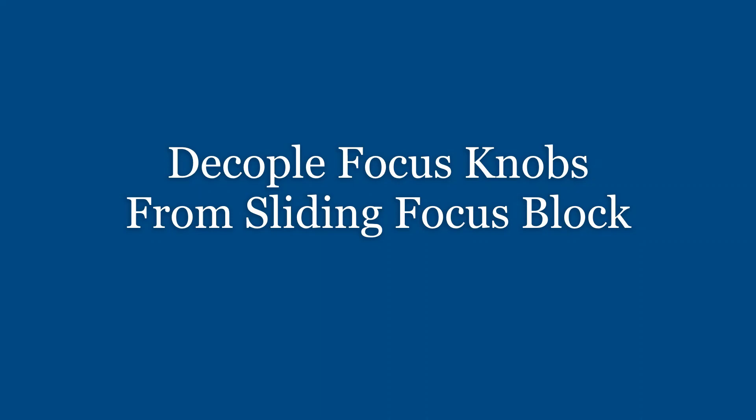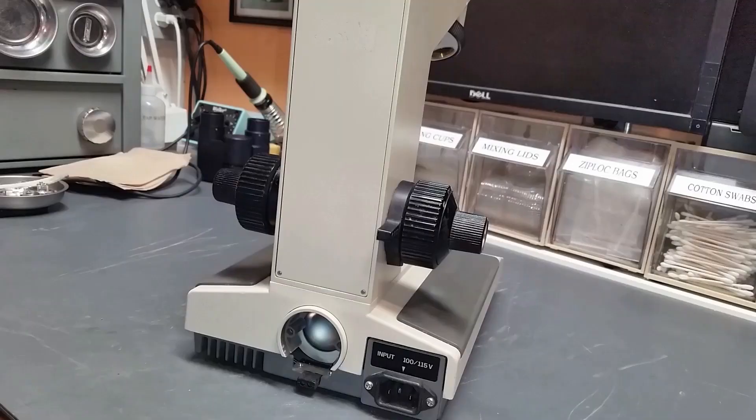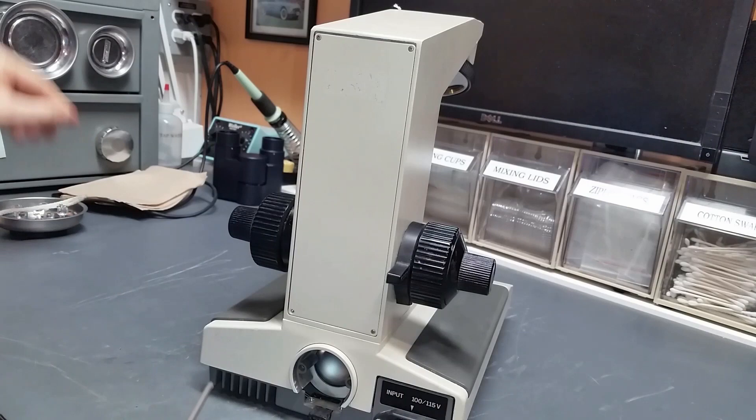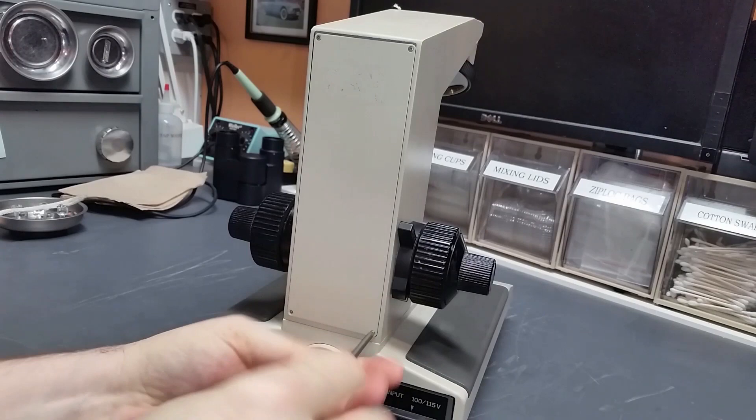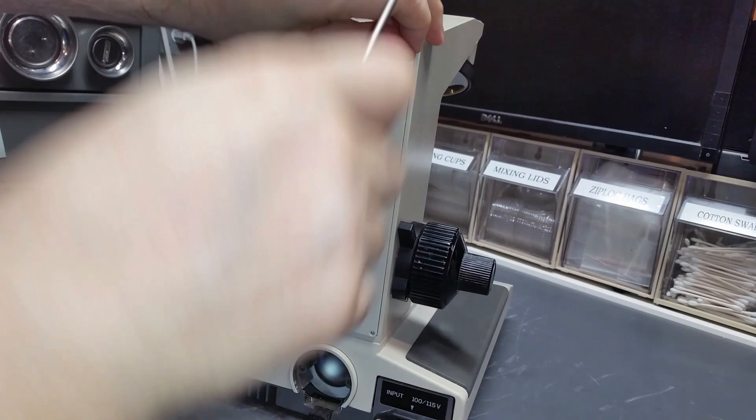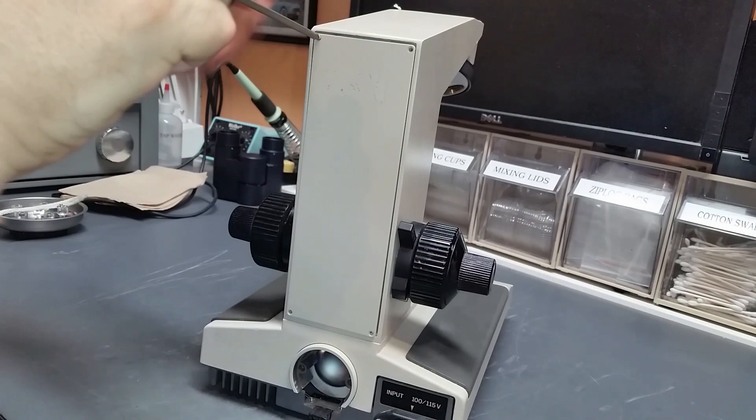Okay, what I'm going to do first, in order to evaluate what kind of condition this thing is in in terms of its maintenance, is I'm going to pull off these four little screws here, take the back cover off. The reason for doing that is because once I get this back cover off, that will expose a gearbox inside, and then I can pull that gearbox out, and at that point I'll be able to determine how stiff the coarse focus mechanism really is and how bad the sliding focus block is as well.